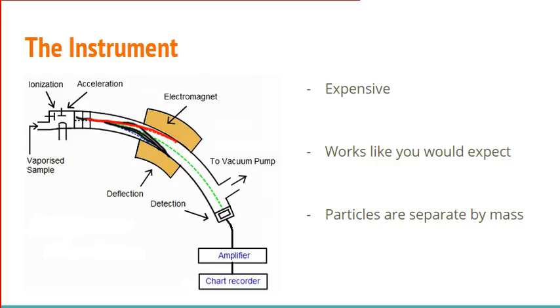The only ones that make it to the detector, the thing that knows the isotopes, is here, all the way down in the middle. And so if you have an isotope that is just one mass unit away from that isotope, it'll fall here. If it's lighter, if it's one mass unit heavier, it'll turn a little wider. So where it hits on the detector is how we see the mass. And so what you'll do is you will see in the spectra, the output of the instrument, peaks based on where each of these isotopes will hit. All the junk will never make it through the curve. The real heavy things, if there's stuff that's not those isotopes, will hit the side of the tube.